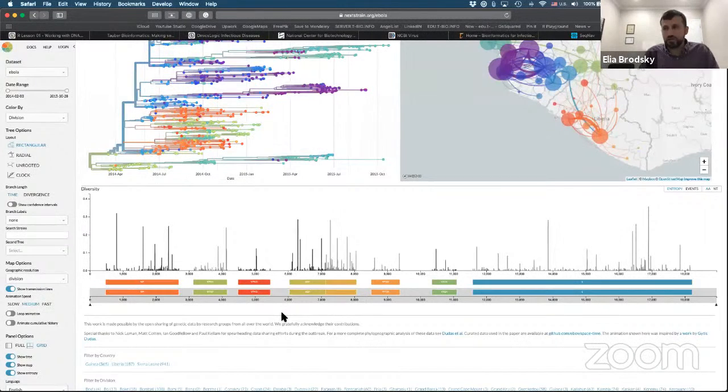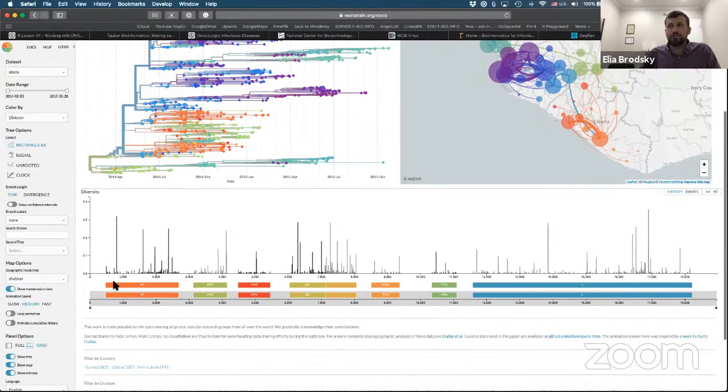So let me ask you a question. Out of all the proteins that you see on this reference genome, which protein do you think has the highest diversity measurement? This is the y-axis, the diversity measurement. So which protein has a position that is the highest in terms of its diversity? Okay, so Mohammed is saying SGP. So this is SGP right here. Anyone else?